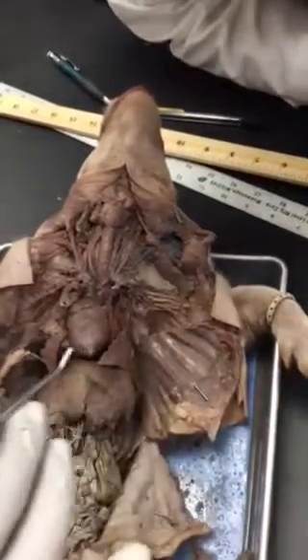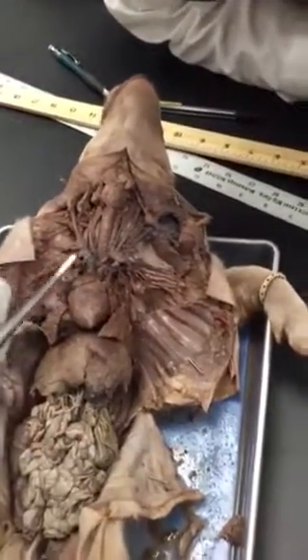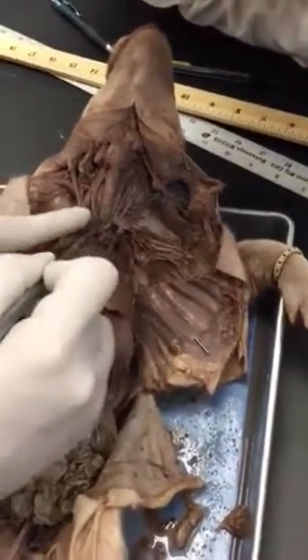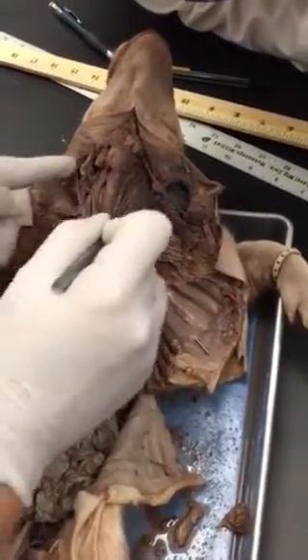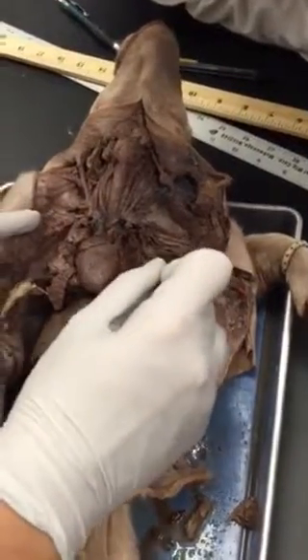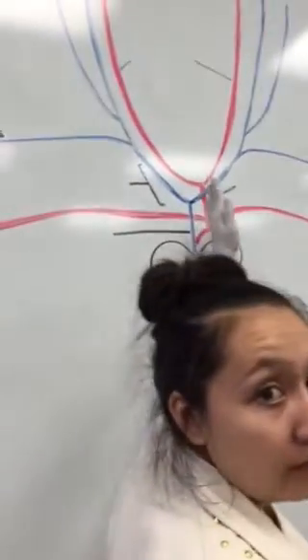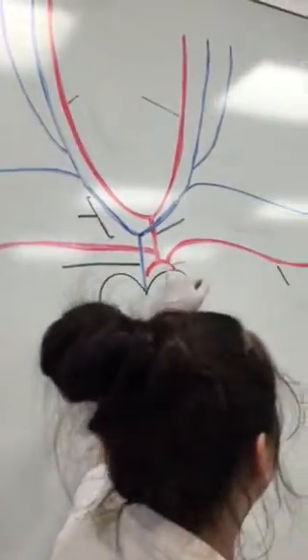And the cool thing about veins is that they're symmetrical on both sides. So you have superior vena cava, brachiocephalic, you have your internal, your external, and your subclavian veins, okay? Exactly symmetrical on both sides. Really cool, right? Okay, arteries, not so much, a little bit more difficult.